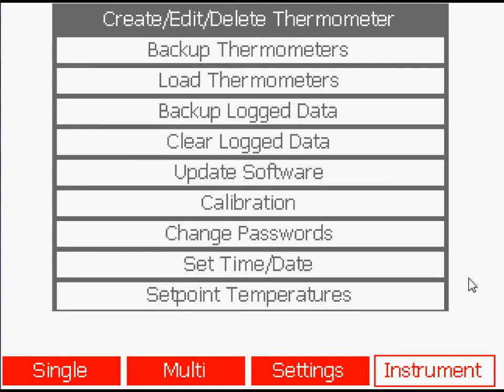You can also change passwords and date and time settings and define temperature profiles you wish to use when calibrating thermometers with an Isotec temperature source.